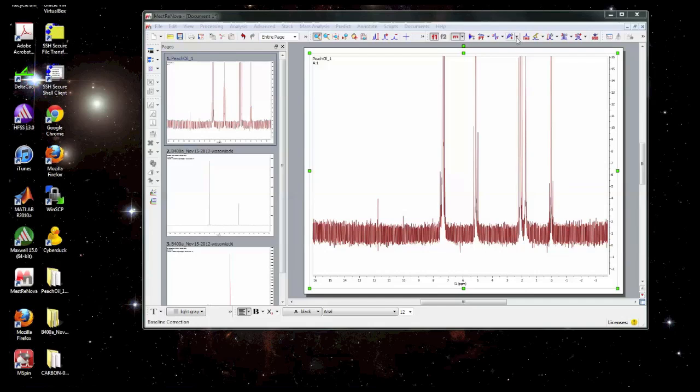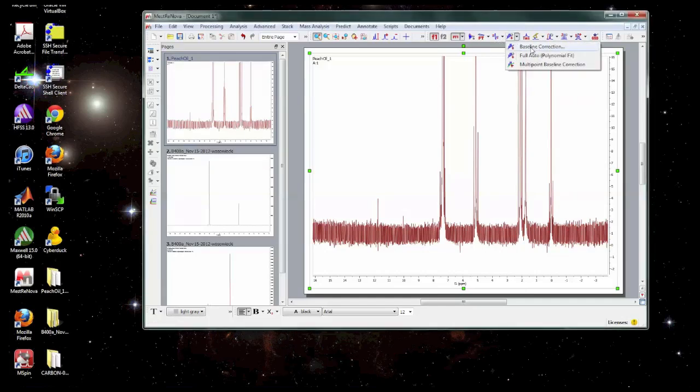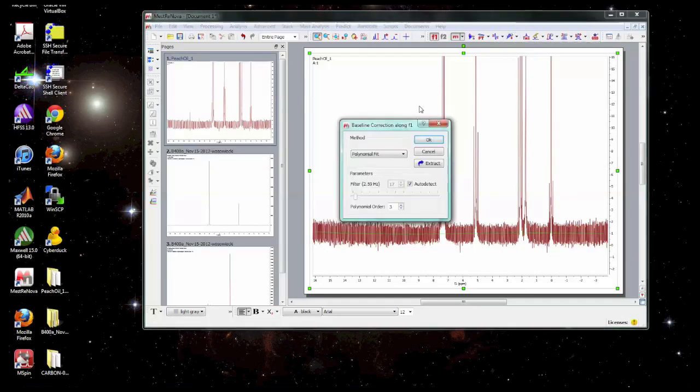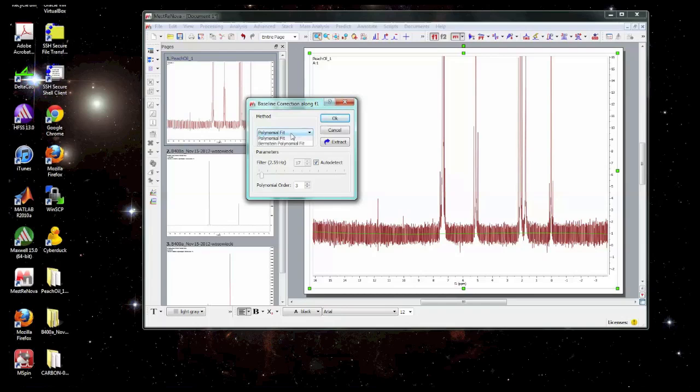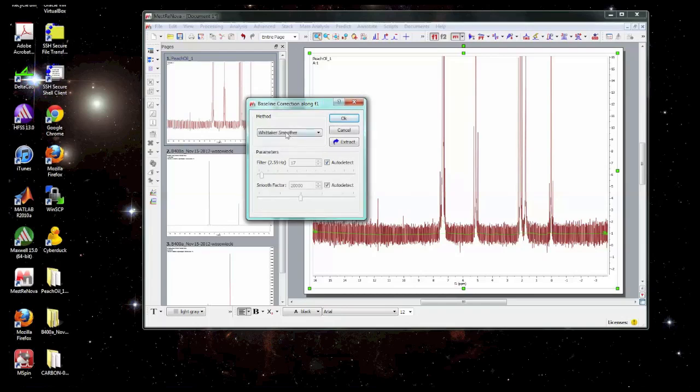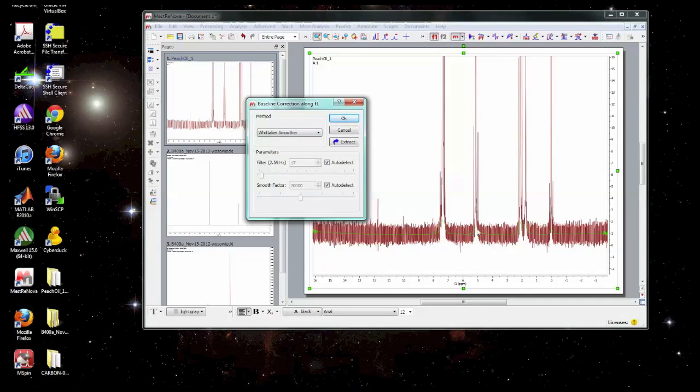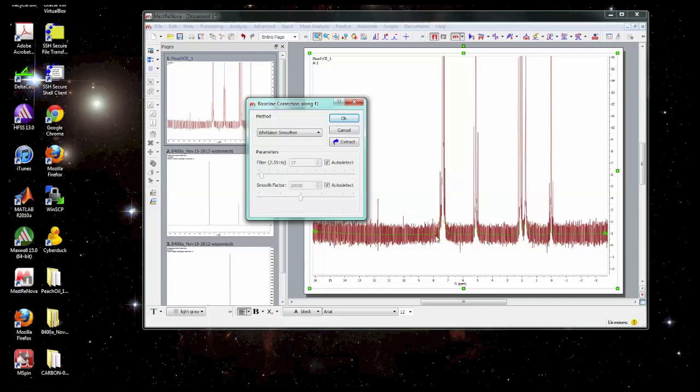So to do baseline correction we can go in here to the baseline correction menu and you can see that there's a lot of options in here. For example Whitaker smoother which is a very aggressive baseline correction algorithm. You can see it's actually fitting some of the real part of the peak and that will remove some real data from your spectrum which is always a concern with baseline correction. So this might be a little too aggressive. Make the spectrum look nice but it might be removing real important information.